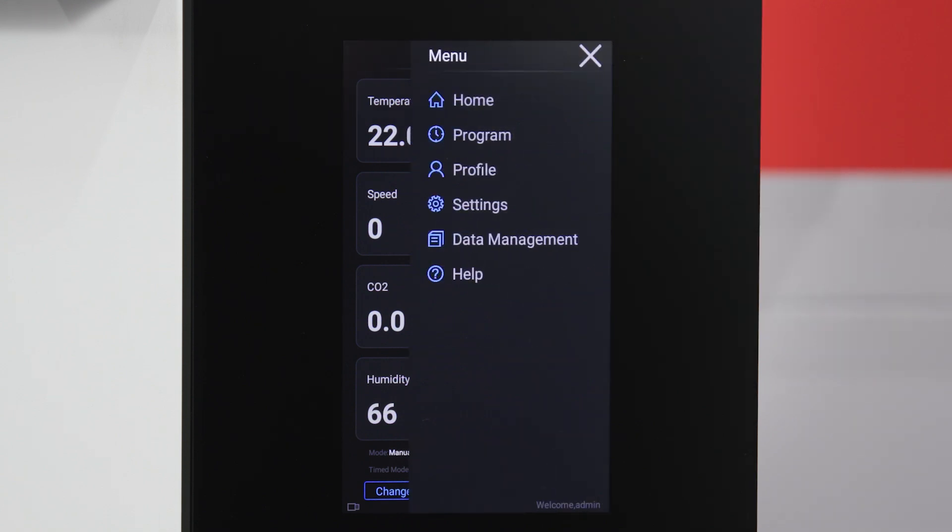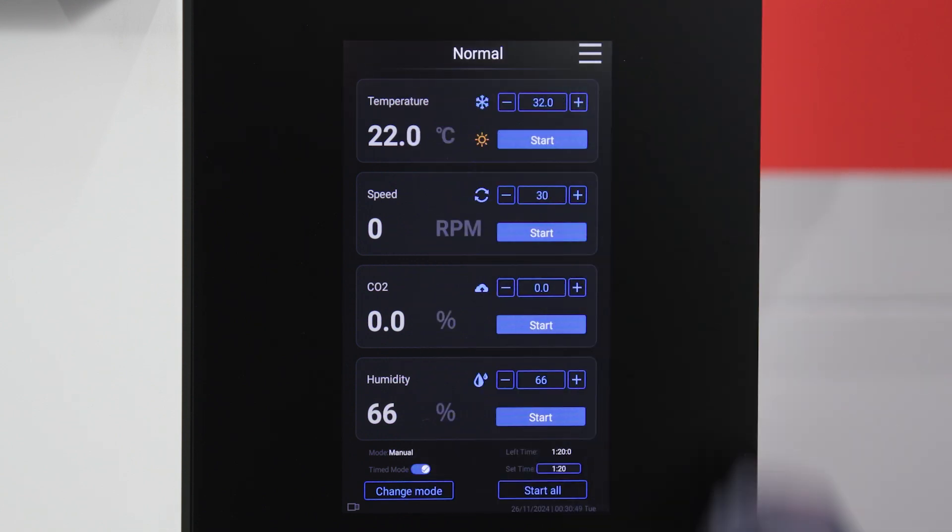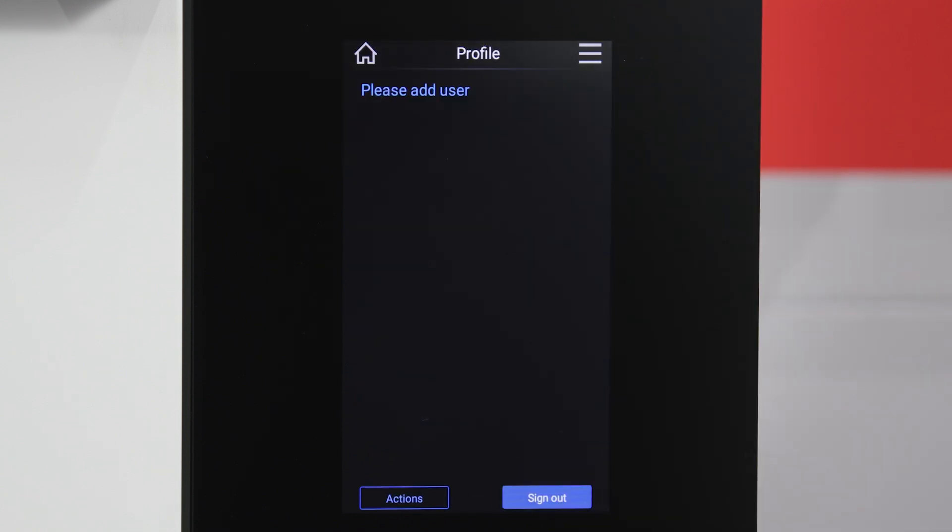Select profile to enter usernames and passwords, edit existing profiles, or add or delete users.